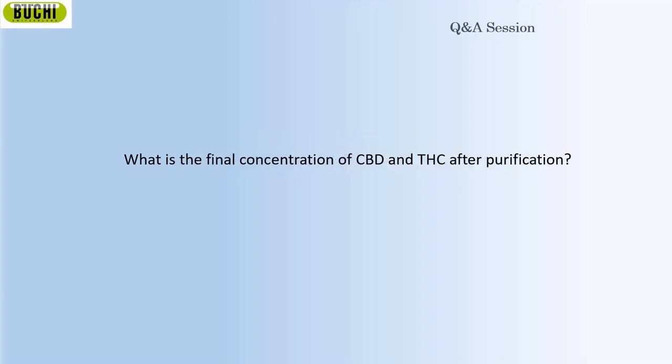Thank you very much. And John, what is the final concentration of CBD and THC after purification? After purification, it is not very possible to say that, but we can say that you can play with the concentration of CBD and THC after the evaporation.